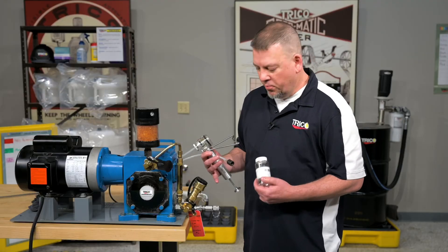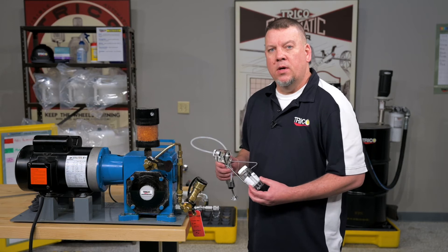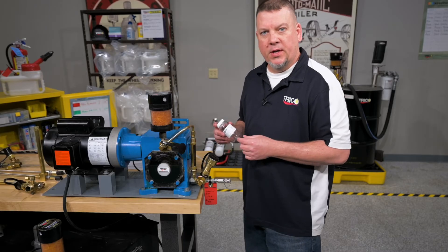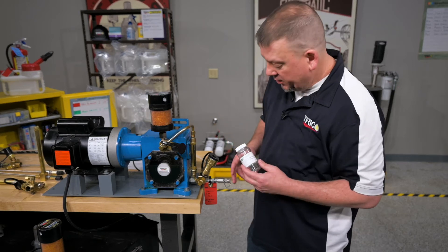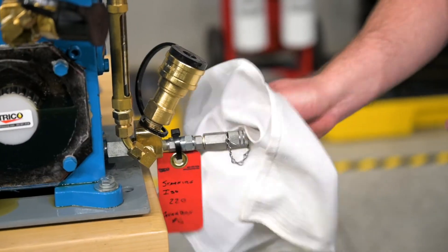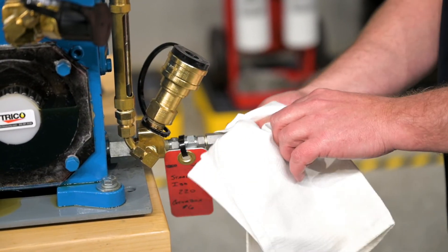Here we have a gearbox with a sample port on it — we're going to show you how to take a sample, and this process will be the same for any piece of equipment using a sample port. The first thing we want to do is take a look at our bottle label and make sure it matches our ID label on the piece of equipment. Using the lint-free cloth, we are going to clean off the sample port of dirt and contaminants.